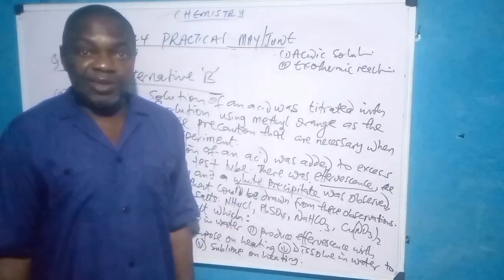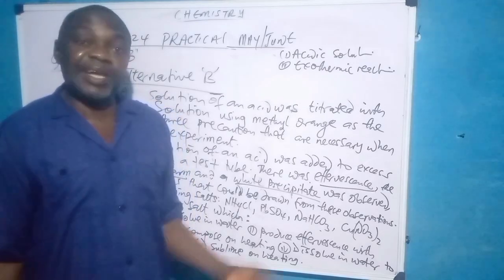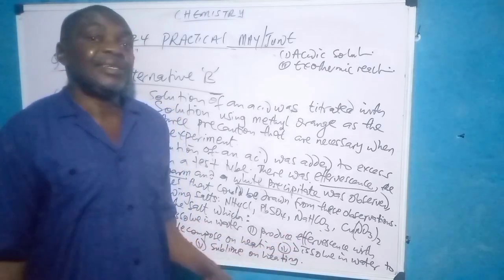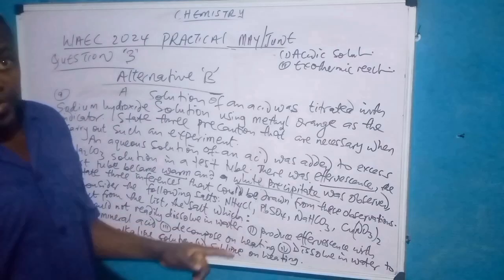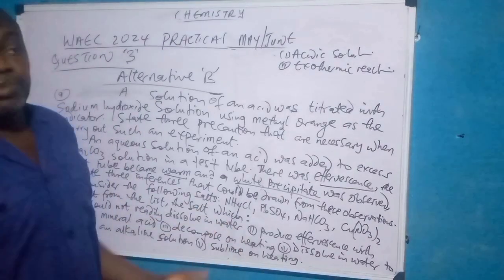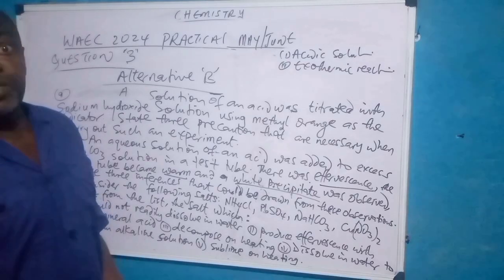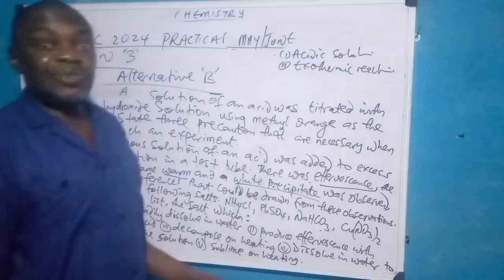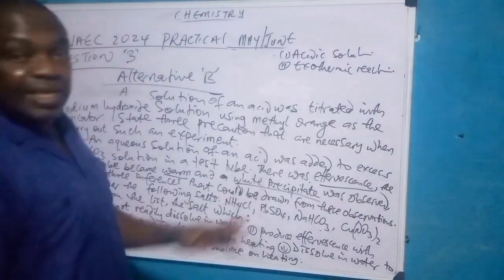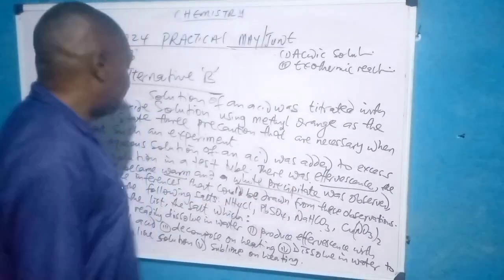And if it's aluminium too, it's a white gelatinous precipitate. Only that zinc will be soluble in sodium hydroxide, and the other one is also soluble in sodium hydroxide, but use ammonium hydroxide to separate them. While the zinc salt is soluble in ammonium hydroxide, aluminium is not soluble. But they didn't ask for that. So it's just a salt containing zinc or aluminium.